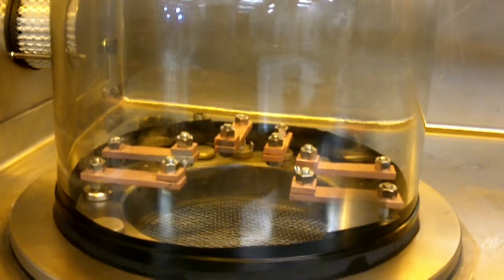We will do a deposition with filament number two, which is the rear one. I'm going to turn the filament power on and slowly increase the current. Our boat will start to glow.